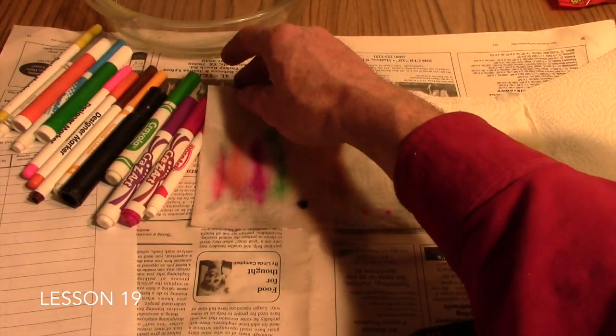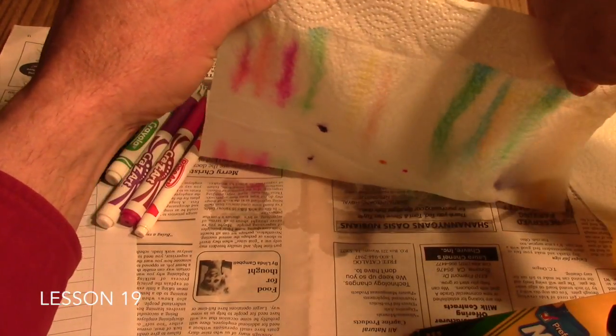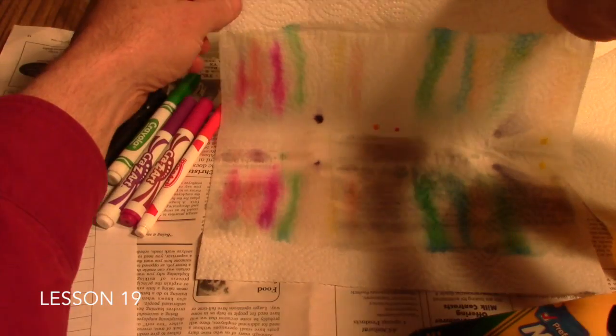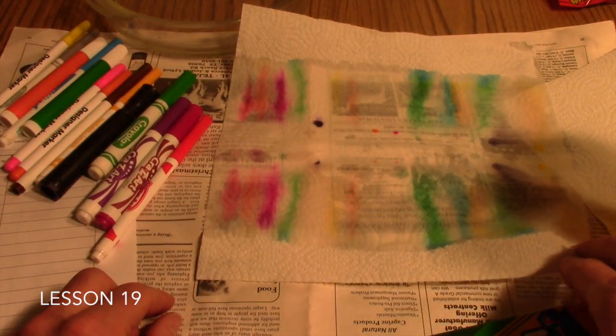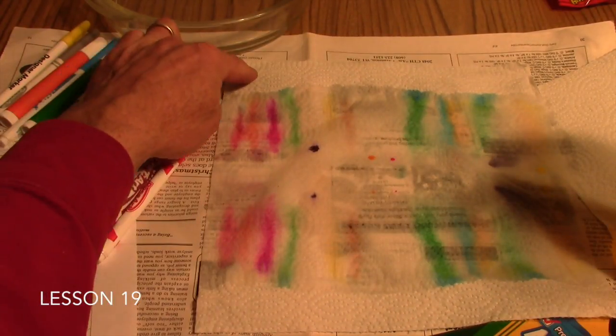If you fold your paper towel before you apply it, you can almost end up with a kind of a fun design then of your work, and then your students can use it as artwork.